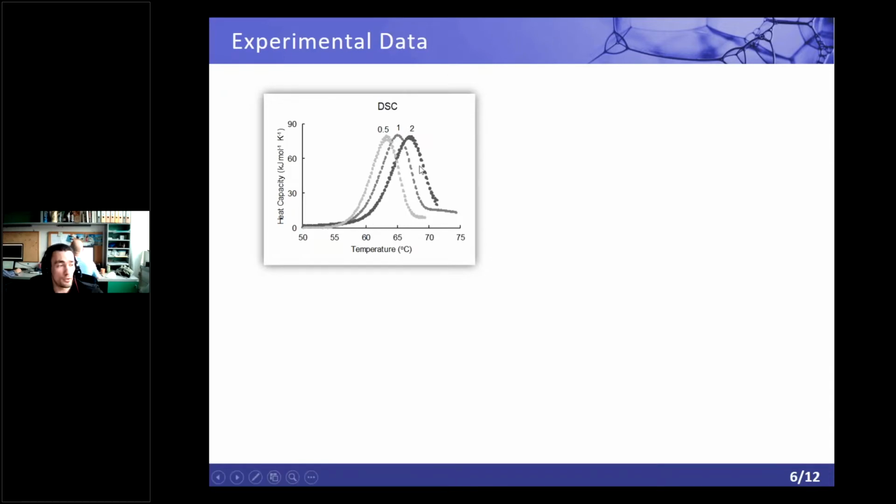And it turns out that when there is an unfolding event, you will have a peak on this thermogram, because the protein will consume a lot of energy just to change its conformation rather than increase temperature. So the machine has to send more heat to keep up with the scan rate of the temperature. And this is how people usually measure.